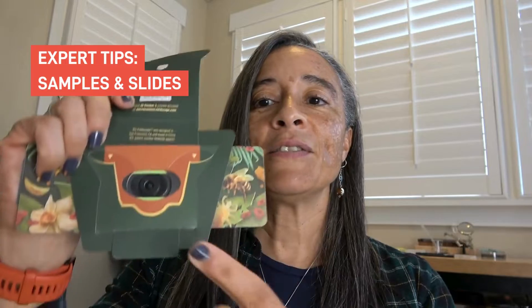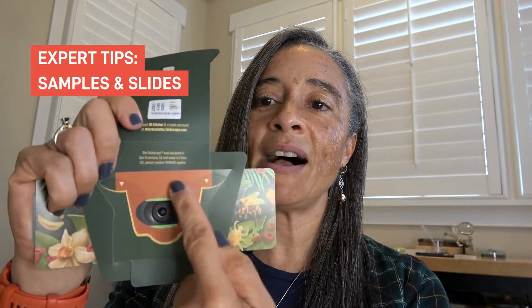And of course, the Foldscope 2.0 is still compatible with glass slides. Remember though that the Foldscope 2.0's slide pocket is a lot bigger than that of the original, and this is to accommodate our new trading cards. So here are a couple of things that you can do to prevent the glass slides from moving around with all of that extra space.